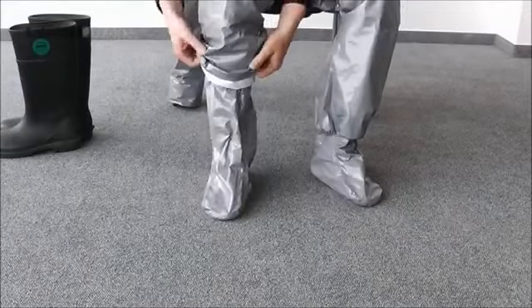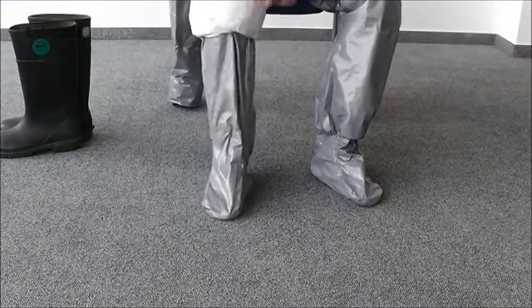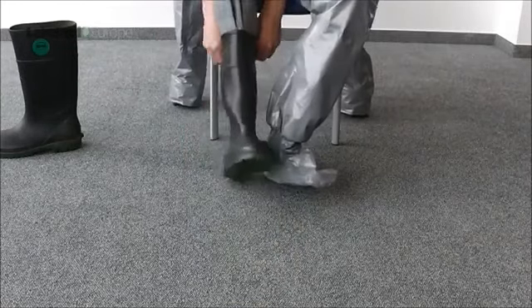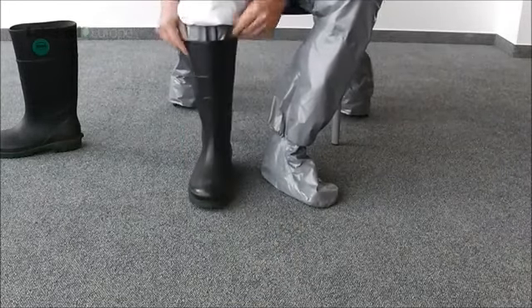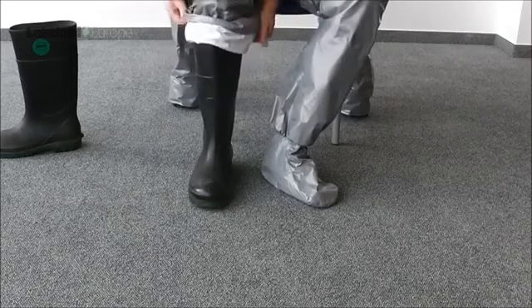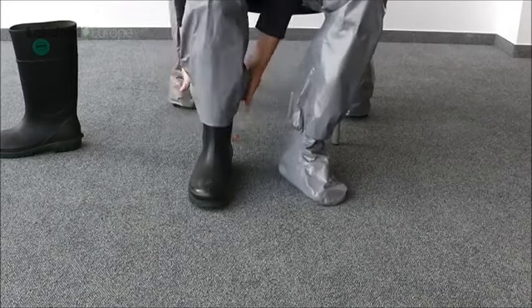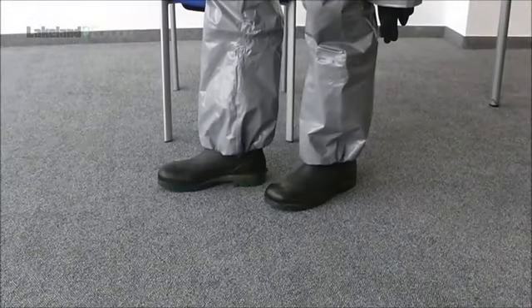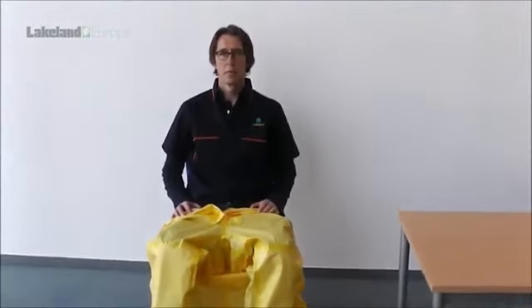Ensure the elasticated ankles of the garment are pulled down to cover the top of the boots. Where a garment with attached socks or booties is used, the sock should go inside the chemical boot and the outer flap is pulled down over the outside of the boot. This is seen on the Lakeland Chemmax 3 coverall with attached socks. This provides an effective seal and prevents chemicals from running into the boot.